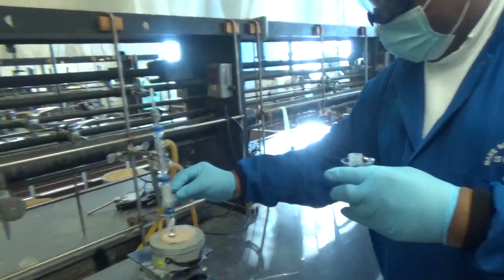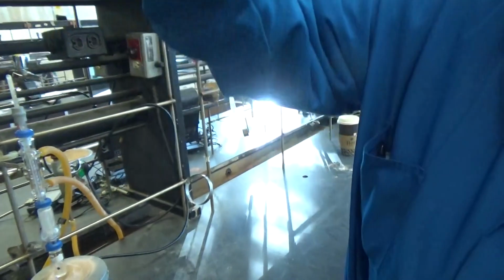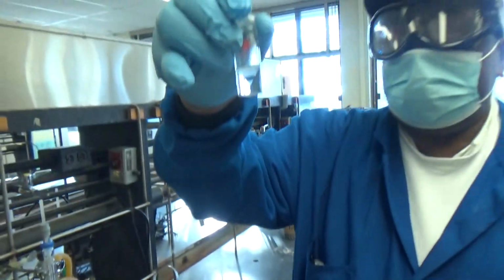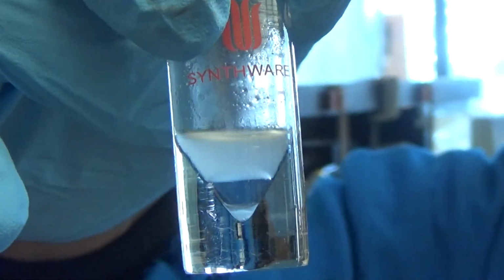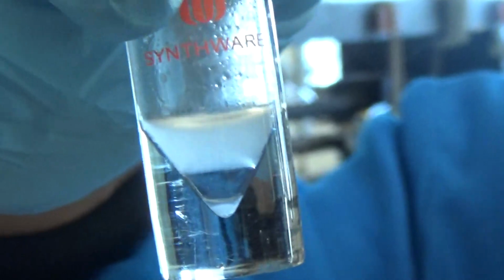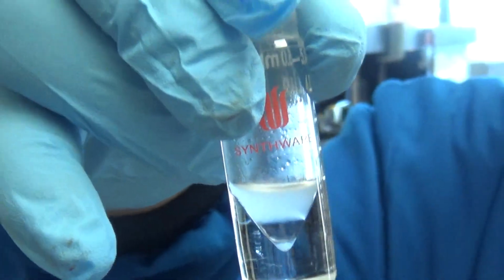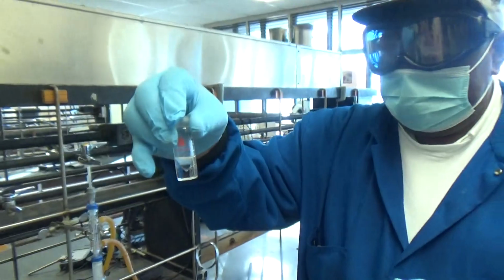You see the smell? The smell is not good, eh? Let me smell it. Can you smell it? No, the video can't smell it. Oh, it's got a weird smell. And you can see two layers, so maybe a top and a bottom, and we need the organic layer, which is maybe the top, I think. That's my guess, because unless it's chlorinated, it's usually on top. Okay, cool.